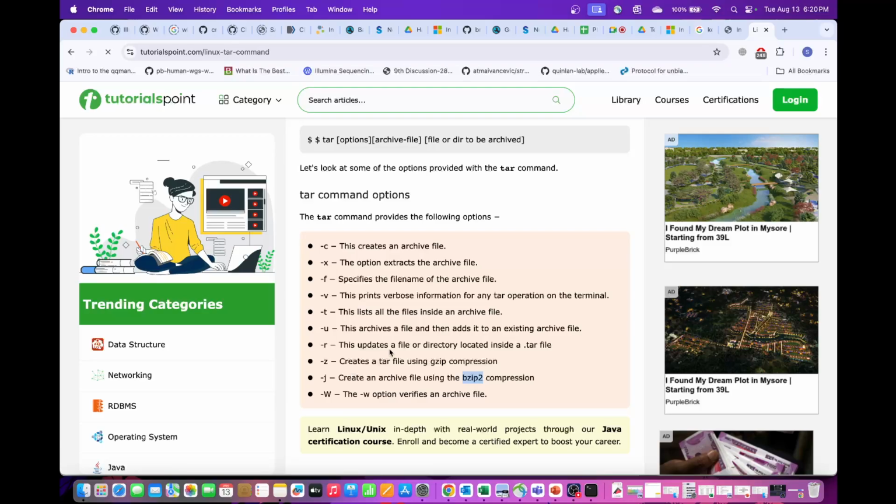But we need to use two different commands, right? First we need to extract the tar file. No, no. What I remember is that we need to extract first the tar file and then the zip file. I may be wrong. You can do it together, like tar hyphen xvf, these things you can do together. You can do it separately as well, but you can do it together. In one step it will unzip and give you all the folders and files. Okay.